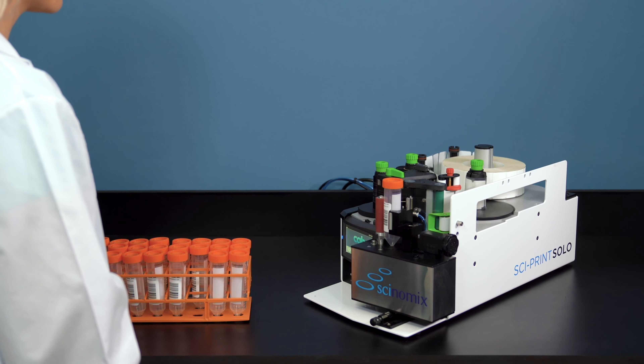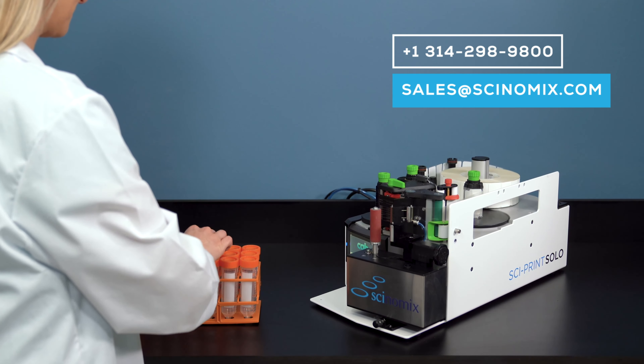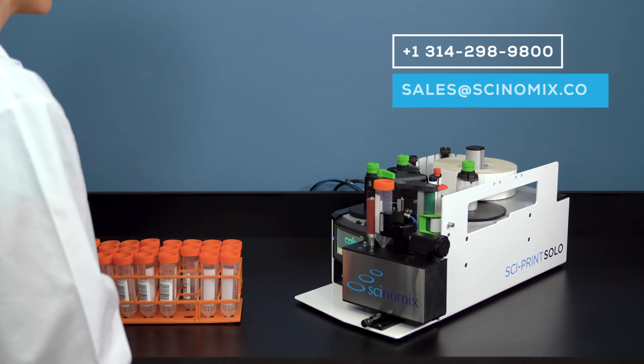Labels and ribbons are designed to be changed by staff members in just a few simple steps. For more information or to schedule a hassle-free demonstration, please contact your account manager at sales@scinomix.com or by calling 1-314-298-9800.